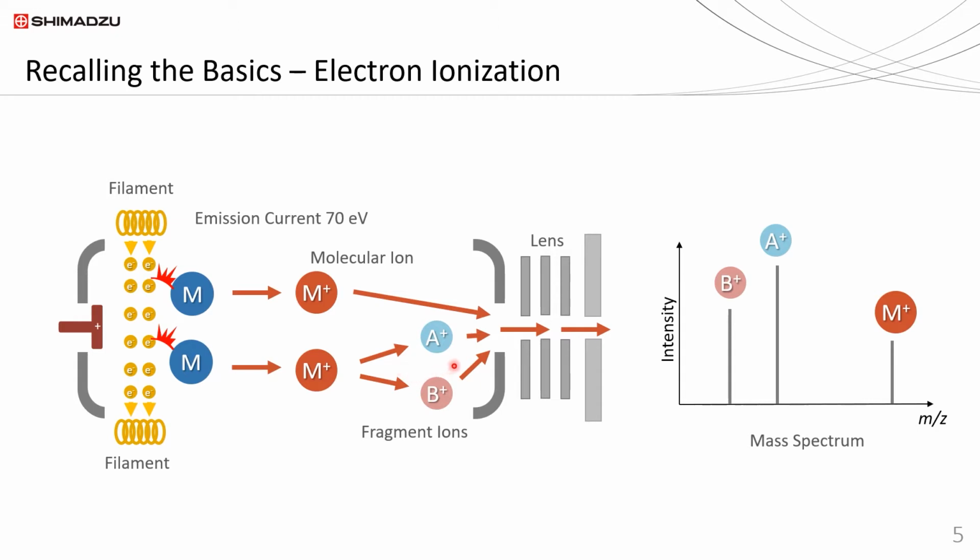As all ions ultimately reach the detector, it forms a mass spectrum that consists of fragment ions and molecular ions. This is the mass fingerprint of a compound, and it differs from one compound to another. As such, this mass spectrum can be used for compound identification. Despite the simplicity, GCMS has become a commodity in chemical analysis for the past 40 years or more.